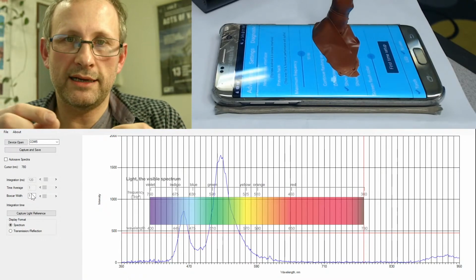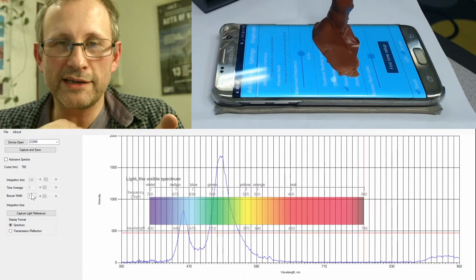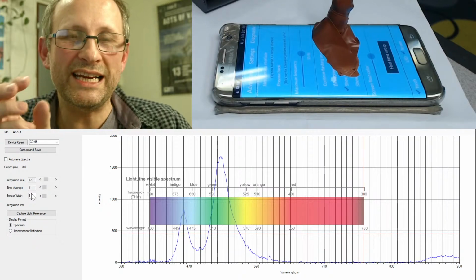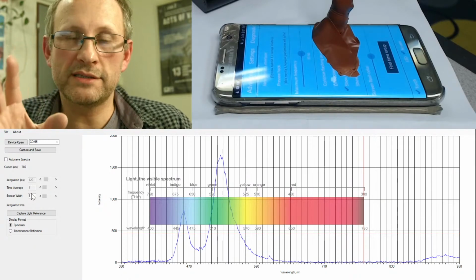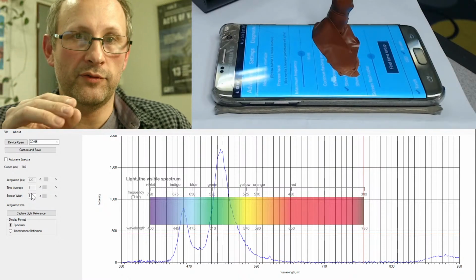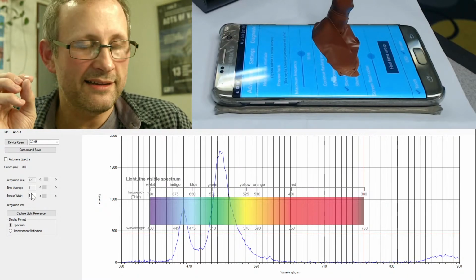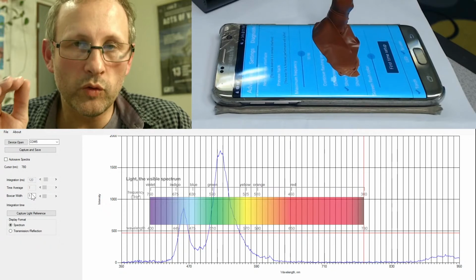Secondly, if you want to be looking at X-rays, you don't want this kind of device. You want a scintillator, like we already have, or something like an X123, which is able to look at really soft X-rays with, I think, a germanium pin diode or whatever. But those devices are not cheap. They are really expensive, and fortunately, I think Alan acquired one secondhand, so it is possible to get something cheaper. But this is an order of magnitude and then some more affordable.